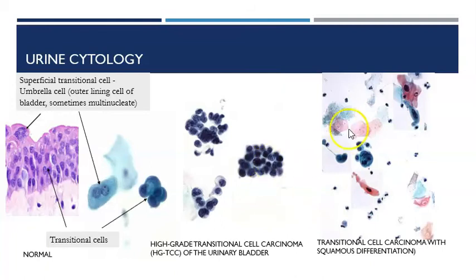squamous cell differentiation. So squamous cells are large, flat, protective cells, squamous coming from scaly, and they stain positive for keratins, as we've just seen on the Papanicolaou stain. So you can see here you've got a mixture of cell types, some squamous, some epithelium, some very small, probably lymphocytic cells as well in there. So a whole mixture of things within that sample.